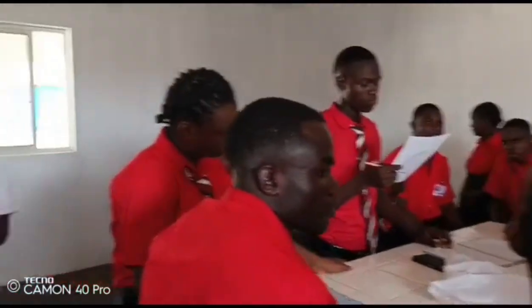We know very well now all food contains starch, right? So we have to test and see whether the food, I told you to bring some food. The next thing I want you to do, I told you that in the laboratory you have to do what? Observation. While we are carrying on the experiment, your food substance you brought will come in.